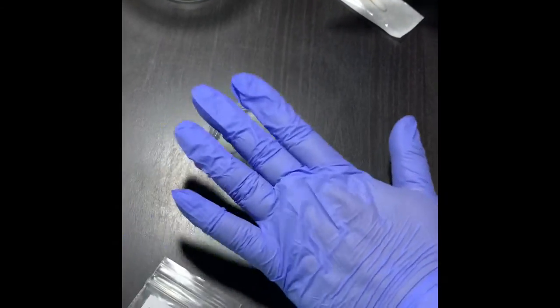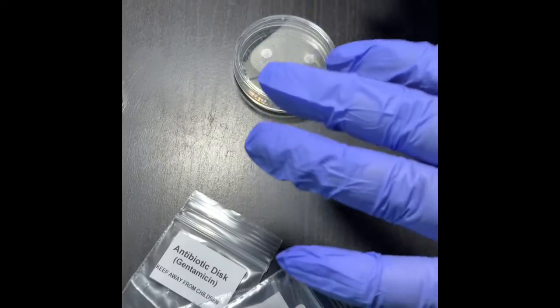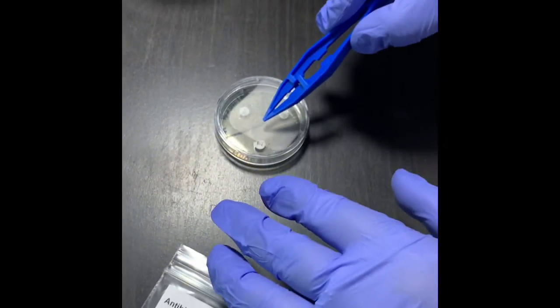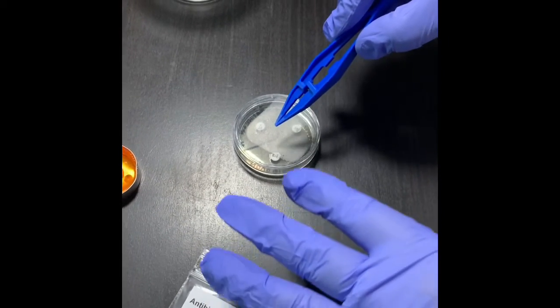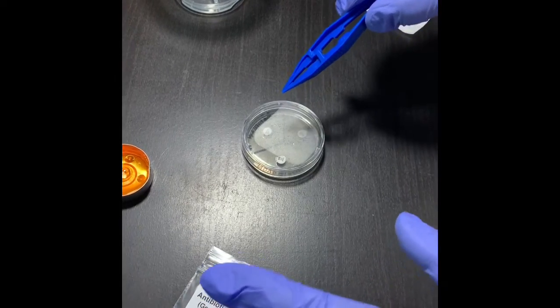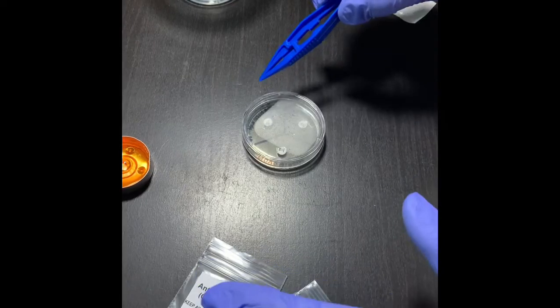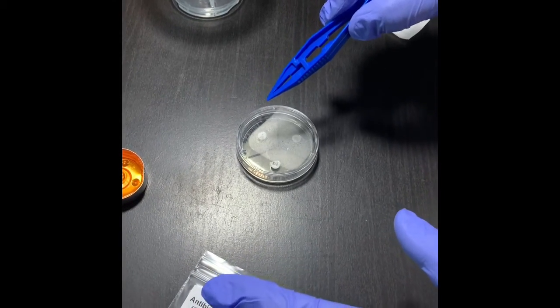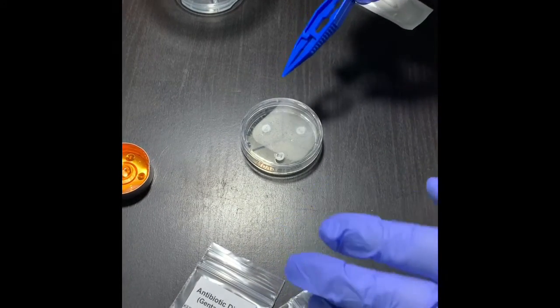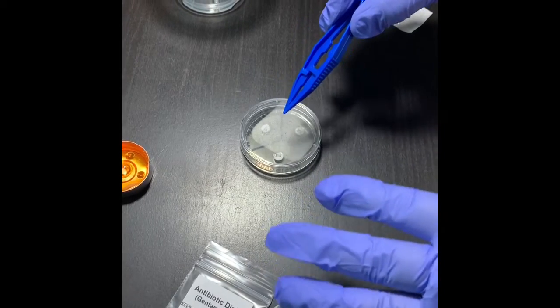So this is done, today's lab. Next day we'll see a lot of bacteria. If any of the antibiotics work, we will see that no bacteria are growing around that tablet. You should go through the lab and learn which antibiotic tablet will work well for gram-positive bacteria, because mostly gram-positive bacteria like Staphylococcus epidermidis are found on our skin. So you can match your result with that.